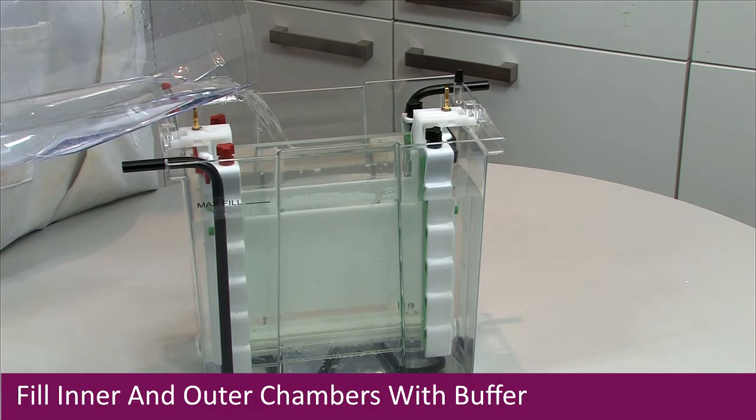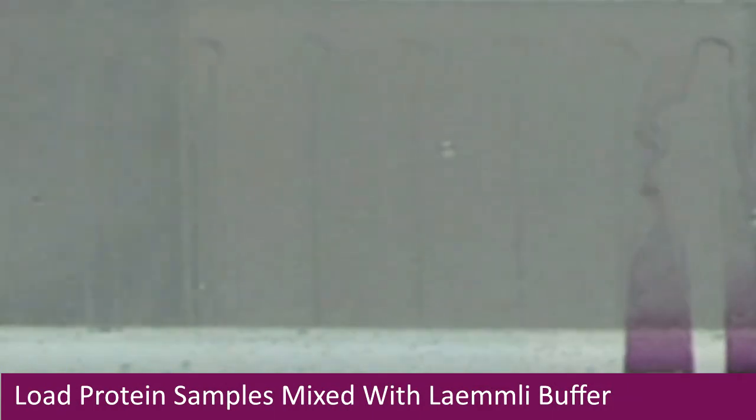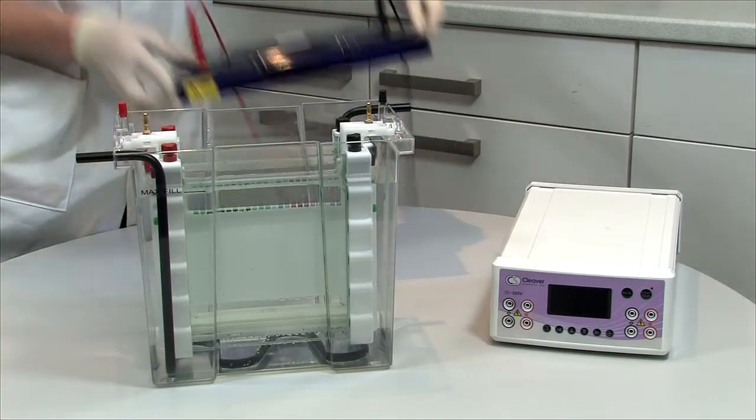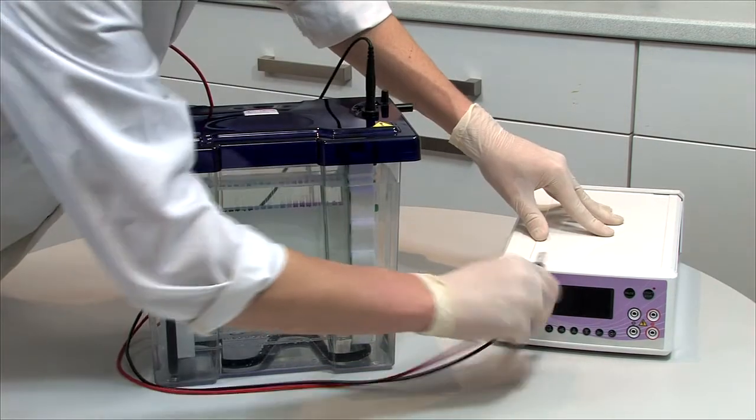Use the provided loading indicator as a template to position the pipette above each well during loading. After loading, replace the lid and insert the power cables into the corresponding colour coded ports in the power supply.